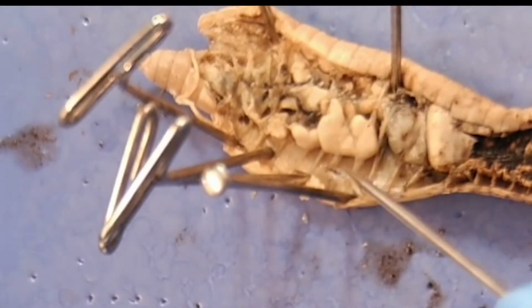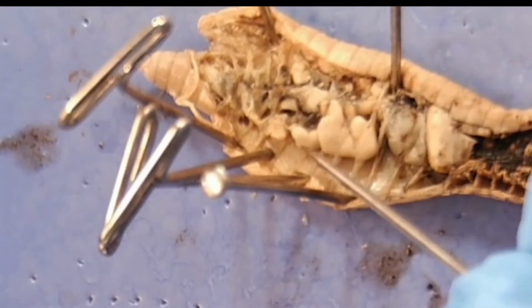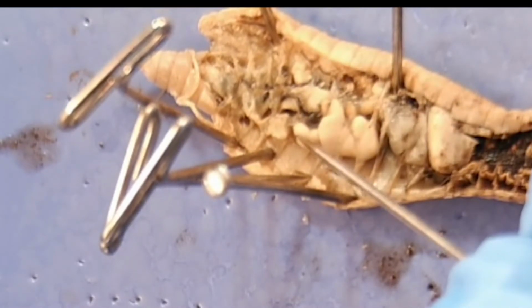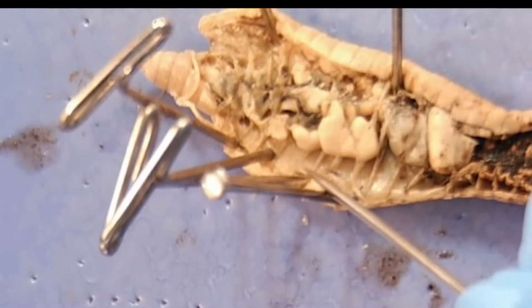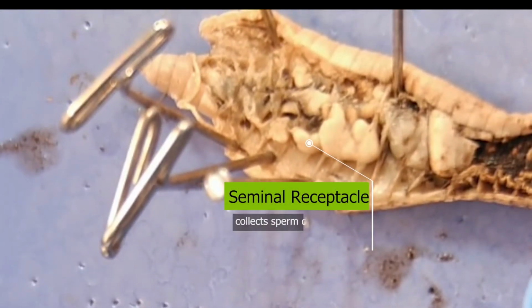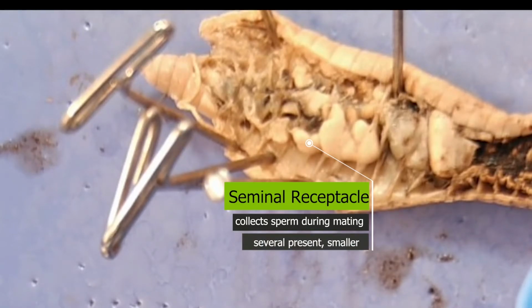Okay. And I don't know if you can see them on the side, you can see some smaller ones, like this one. Yeah. They're a little bit smaller. They're usually along the edges. I think there's one right there too. Those are seminal receptacles, and basically they receive sperm.